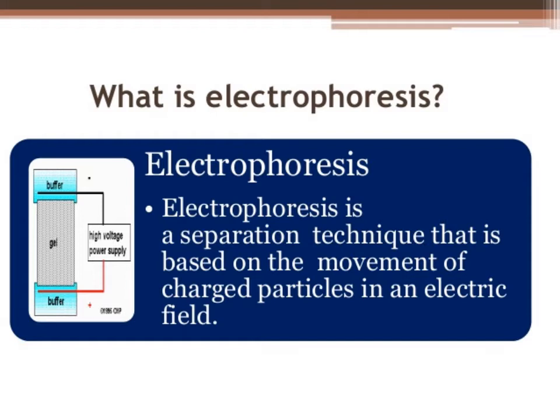The substances which are positively charged will migrate towards the negative terminal, and the ones which are negatively charged will migrate towards the positive terminal. So electrophoresis is a separation technique which separates molecules on the basis of their charge.